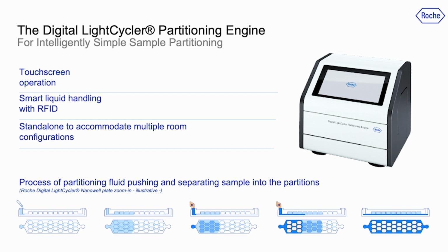One thing I want to highlight here is that sealing ensures that there's no amplicon contamination, right? It's a closed system. You have complete sealing of the entirety of the lane, right? Which is really, really important when you're trying to contain amplicons that are being generated during the digital PCR process itself.